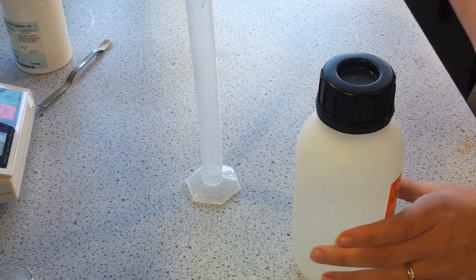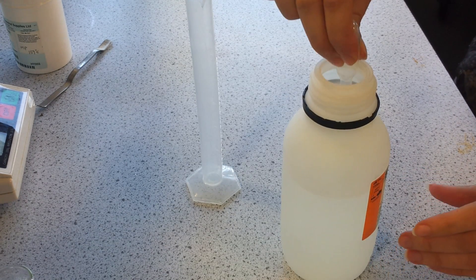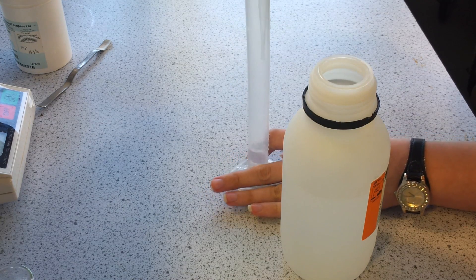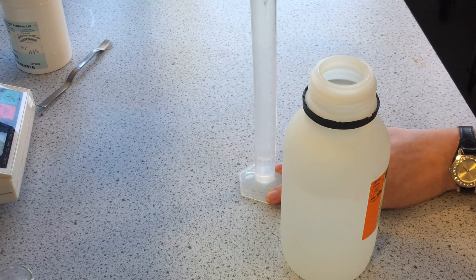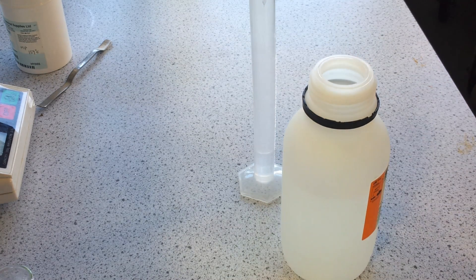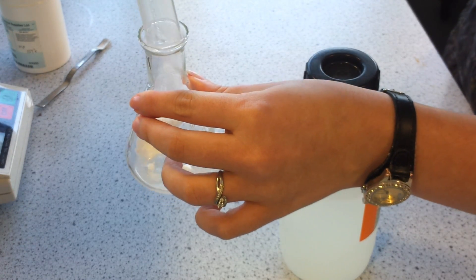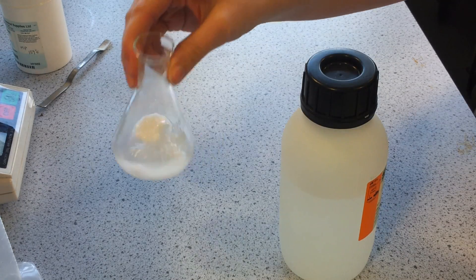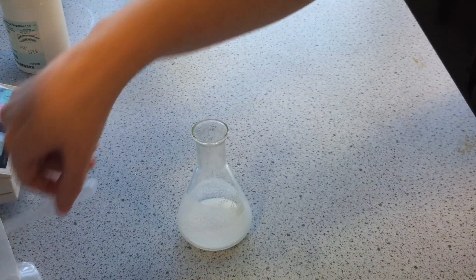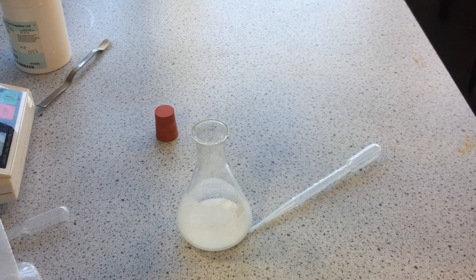And to that you need to add 6ml of acetic anhydride. The acetic anhydride has gone into the salicylic acid, and then finally we're going to add about 6 drops of phosphoric acid.